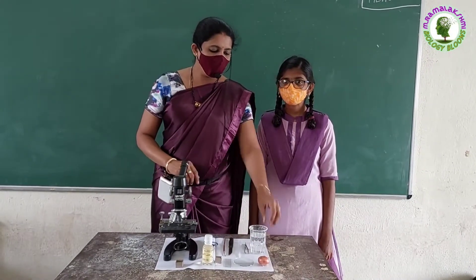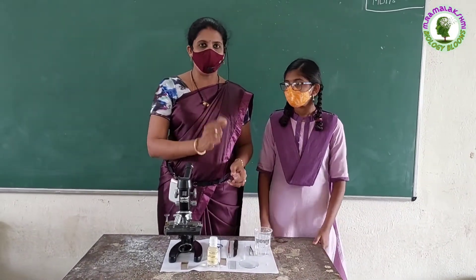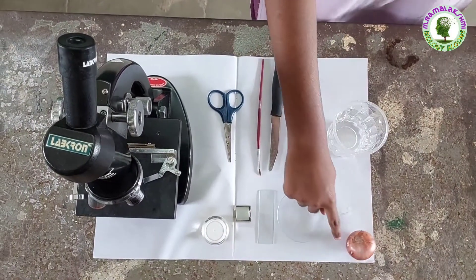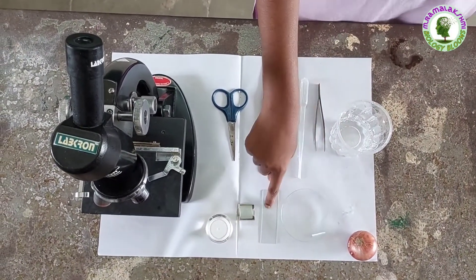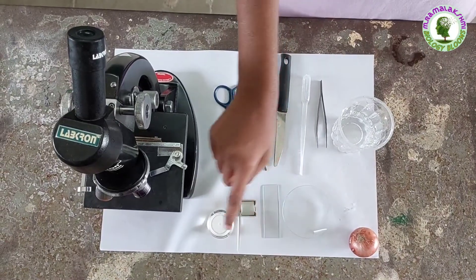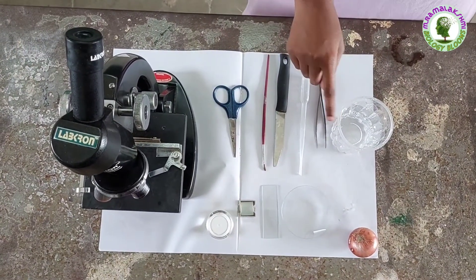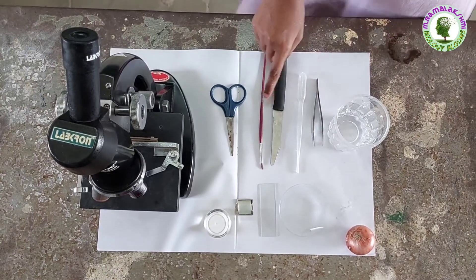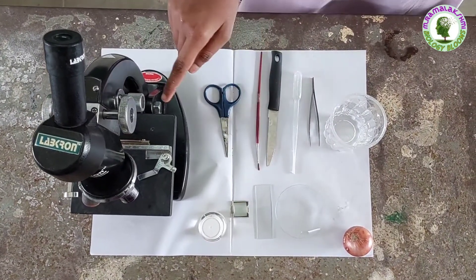Children, today we will observe the cells in onion peel. For this we require: onion, watch glass, slide, cover slip, glycerin, water, forceps, dropper, knife, brush, scissor, and microscope.